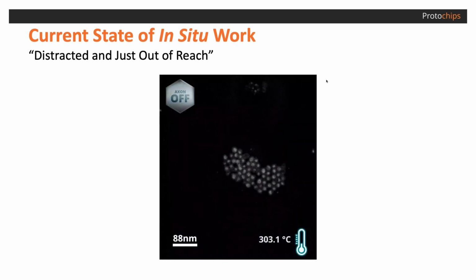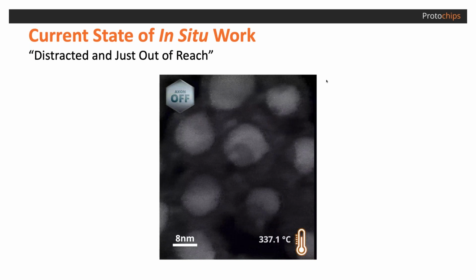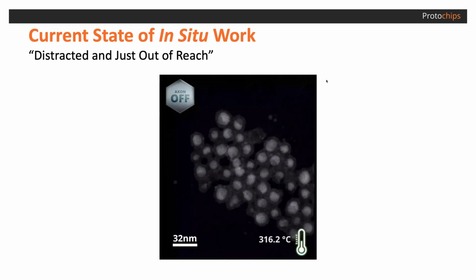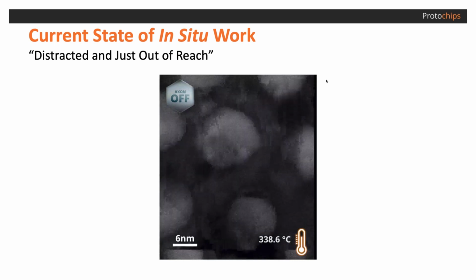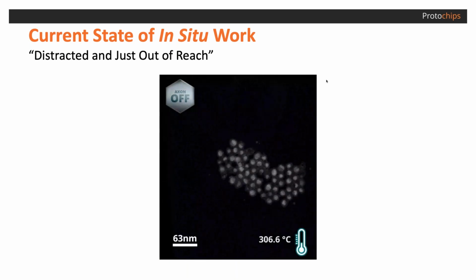And it doesn't look like there's very interesting information here anyway, but when you get to the very highest mag, if you pay attention, you'll see a couple of different directions of lattice information, which tells me the sample and the microscope are in a mode to deliver high resolution information. The problem is the instability keeps me from ever achieving that. So it's almost teasing me, saying, if you could control me, if I would behave, there might be a lot of interesting data available. What's the problem?